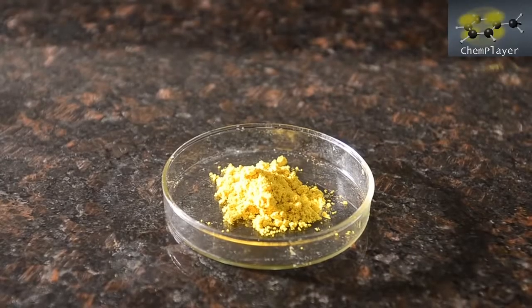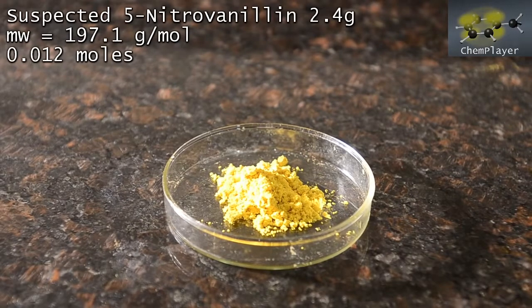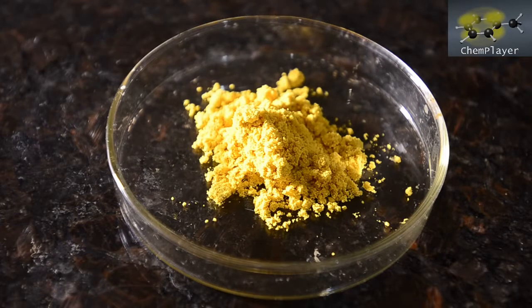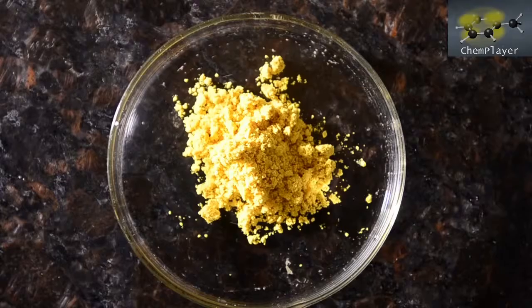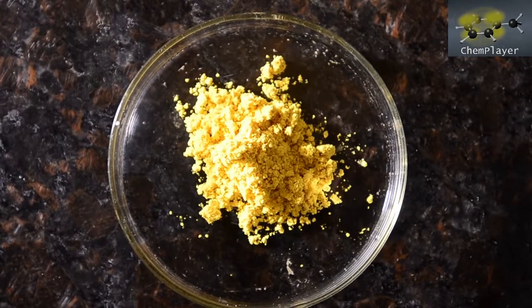We've got some purified product, but out of the 10 grams we put in, only 2.4 grams of crystals. A lot of product still seems to be in the ethanol filtrate, so it looks as though ethanol isn't a great recrystallization solvent. We also tried with acetone and got a similar result. Unfortunately we've run out of chloroform, but we've got a hunch that this might work well, but we'll have to do this in the future sometime. But we do have some nice microcrystals here of what seems to be a pure product of some sort. So let's see if we can do a test to find out if it really is 5-nitrovanillin.